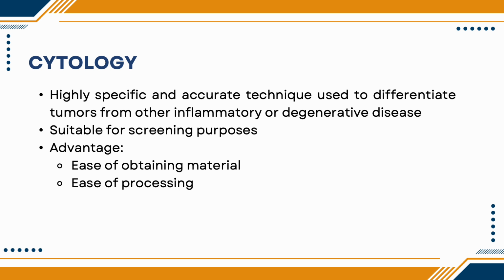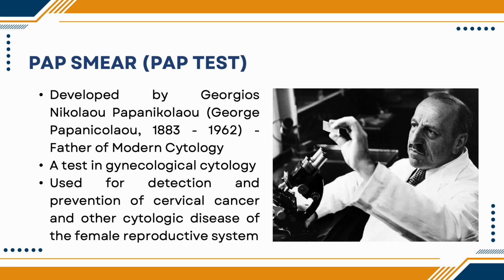Ano ba yung specimen sa cytology? Often, pwede yung mga aspirates. Pwede na yung mga fine needle aspirate, pwede din yung mga fluids of the body such as pericardium, CSF, or your arthrocentesis procedure. Yun sila lahat, they could be subject for cytologic studies. However, in the pap staining technique, you will find out na pwede din pala yung mga vaginal specimens.